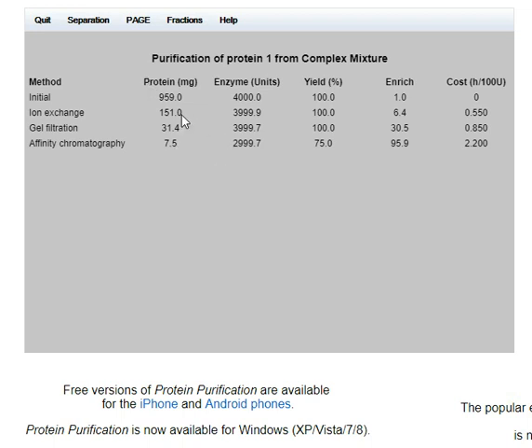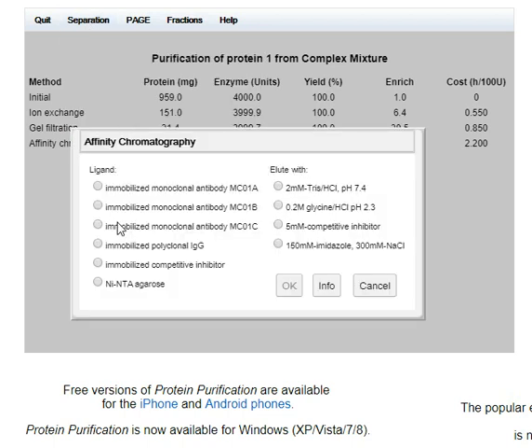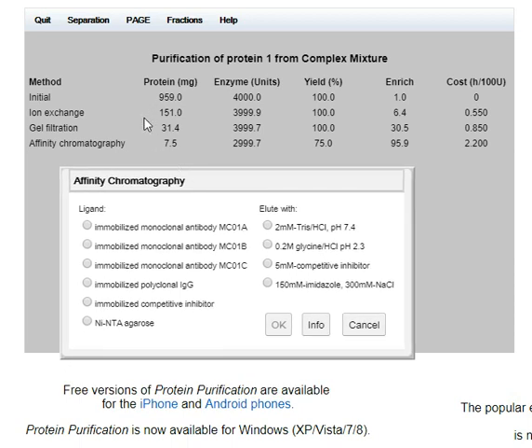The point about this is that using this sort of information would come with time, expertise, and insight. Getting this algorithm together took about a week. Having run through it now in real time in about five minutes, that's condensed down about a week's work into just a few minutes.